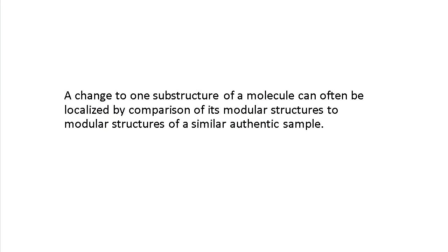In conclusion, a change of one substructure of a molecule can often be localized by comparison of its modular structures to modular structures of a similar authentic sample.